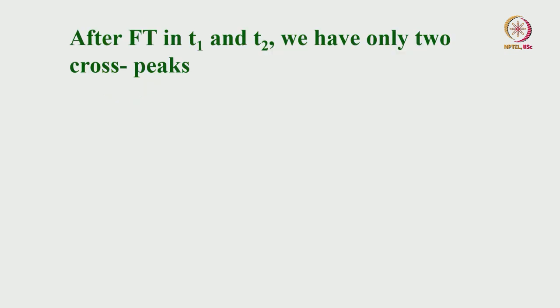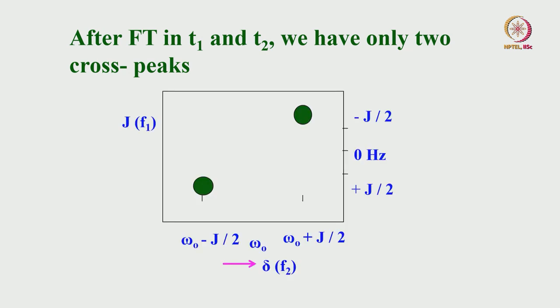We will do that. We will vary T1 and then fix a T2. Collect a two-dimensional spectrum. Like any 2D experiment, T1 is varied with a 180 pulse in the middle, and then we collect the data and do the Fourier transformation.